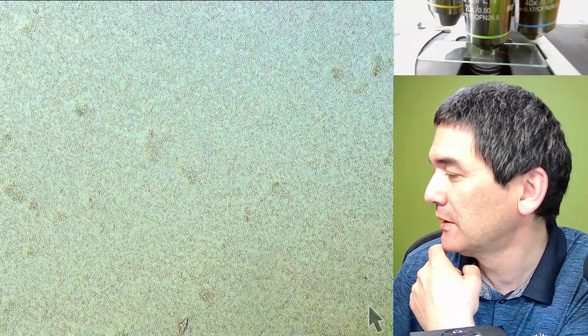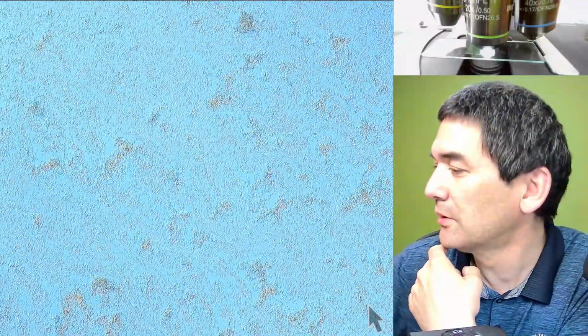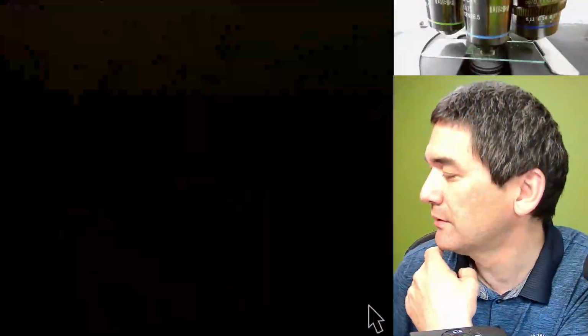I have to close this here. I have to turn this up. So get all the adjustments, yeah. And maybe at 40 times. You see, I have to adjust it.